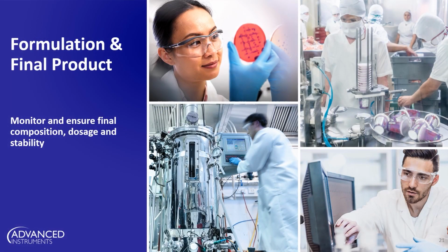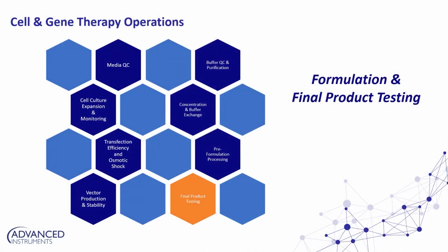And finally, looking at the fill and finish section of this workflow. Osmolality testing has long been a part of the final product release testing for therapeutics. But what are some of the other applications for osmolality within this workflow segment?